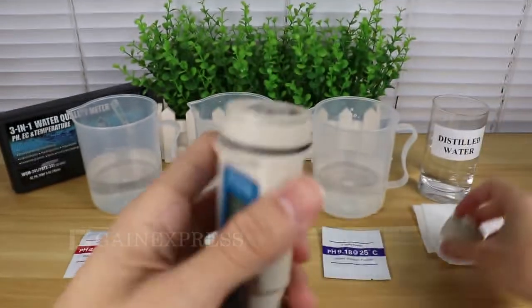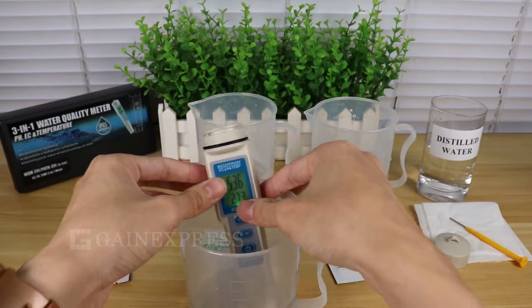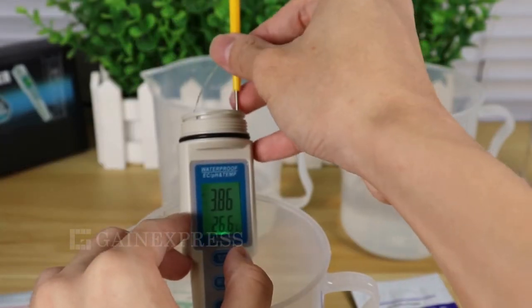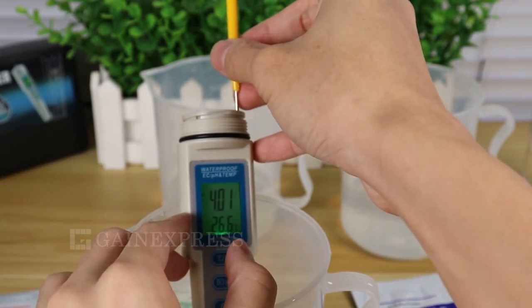Remove the battery cap and look for the pH calibration trimmer. Insert the probe into 4.01 buffer solution. Gently turn the pH calibration trimmer using the mini screwdriver provided in the set until 4.01 shows on the display.